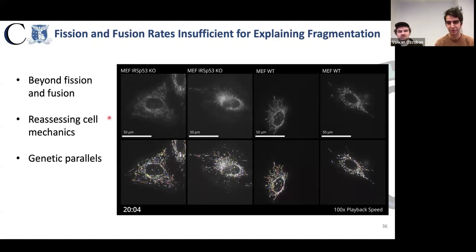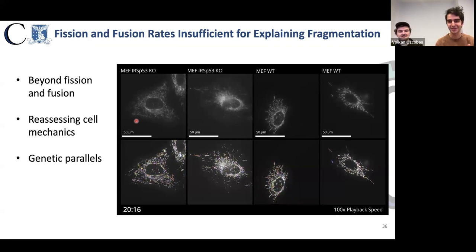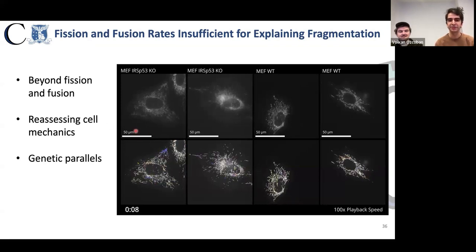Additionally, we've shown these for phototoxicity examples. However, we've also conducted the rates comparisons and network spreading for protein knockouts, so more interesting biological conditions. But for the scope of today's presentation, I won't talk about those as that's quite a different story. But we do observe similar fragmentation and structural behavior occurring under direct genetic manipulation, suggesting alternative drivers may be at work.